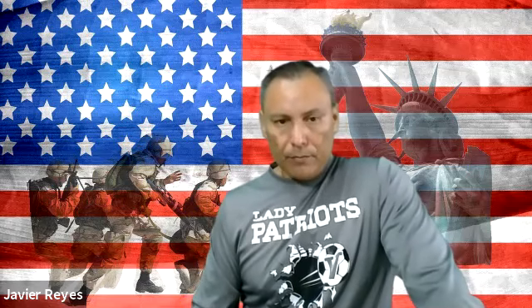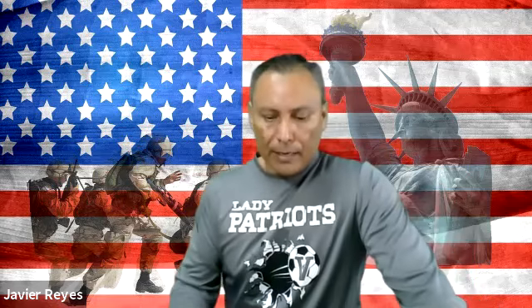If you don't have a little cooling block like the one on figure 12.6, it's an ice block with little holes in it. Ammonia, we just talked about it, right? Ammonia is a waste from the body. It has to be chilled in ice.